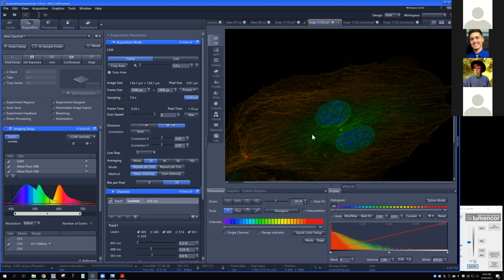If you don't have that luxury, and if there are always regions of co-localization between a couple of different fluorophores, you just can't get fingerprints without doing single positives. So in this case, a phalloidin only, a microtubule only, a DAPI only would be the perfect control to get these fingerprints. So really, really important to do that.